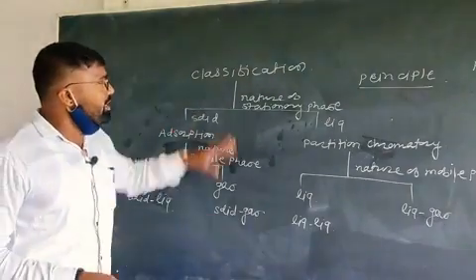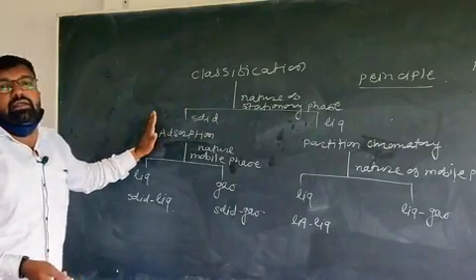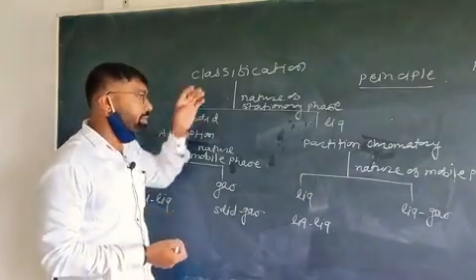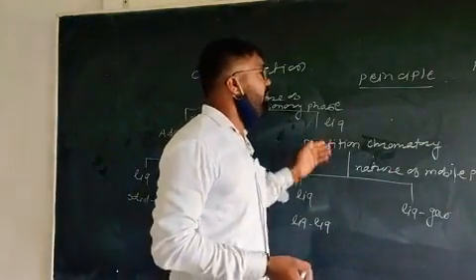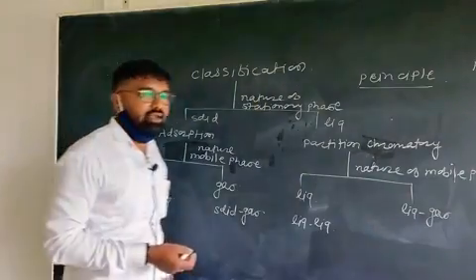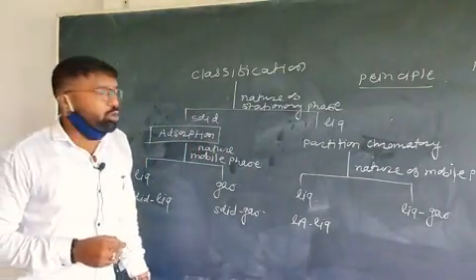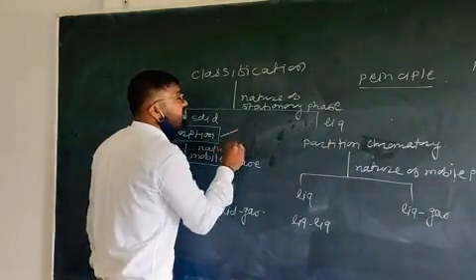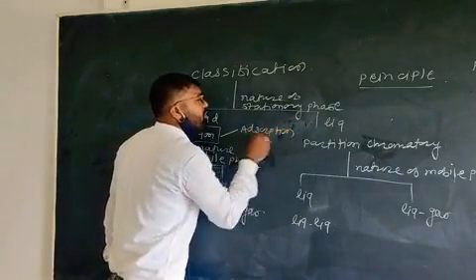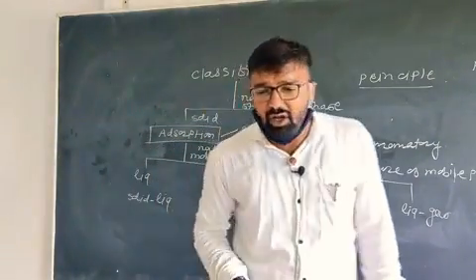Now come to the point: in adsorption type of chromatography, which principle is the basis for separation, and for liquid chromatography, which principle is used during the separation of components of a mixture? First we see adsorption type of chromatography. In adsorption type of chromatography, separation is done on the basis of adsorption. You know very well what adsorption is, what desorption is, what adsorbent is, and what adsorbate is.